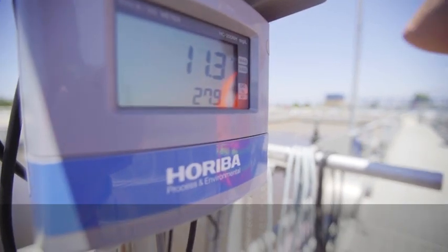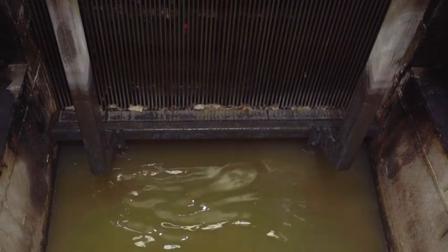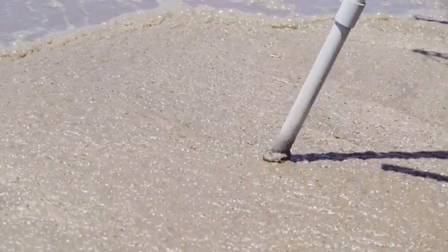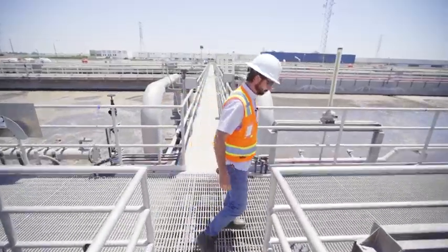As we advance in society, we couldn't exist without wastewater treatment plants. The goal of the ammonia probes is making sure that we completely nitrify to reduce that ammonia as much as possible. We limit our disinfection process of how much ammonia we have to add to the system, so it reduces our chemical demand. We have now been transitioning more to using nutrient-based control of our aeration blowers.